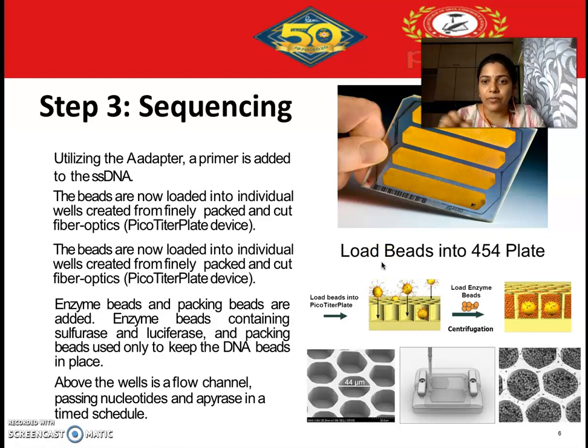So one bead having many copies of the same fragment has now become a library for us. From those libraries, we'll be taking the beads, and now the sequencing will start. The beads are now loaded into individual wells. You can see here, these are wells.